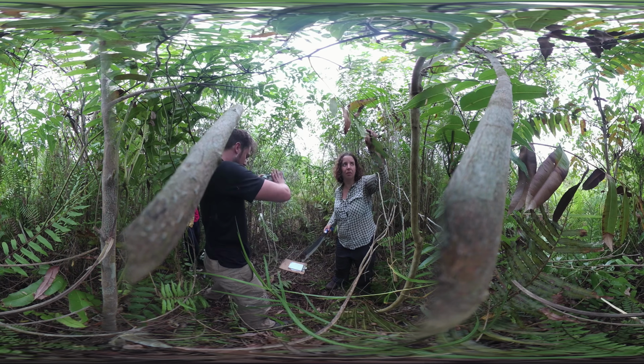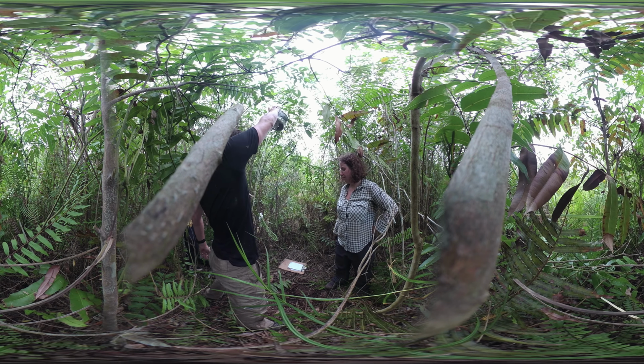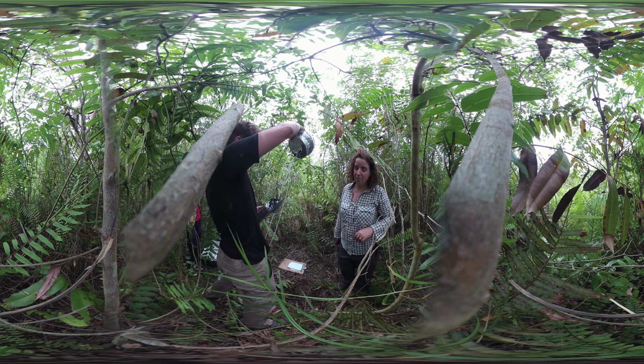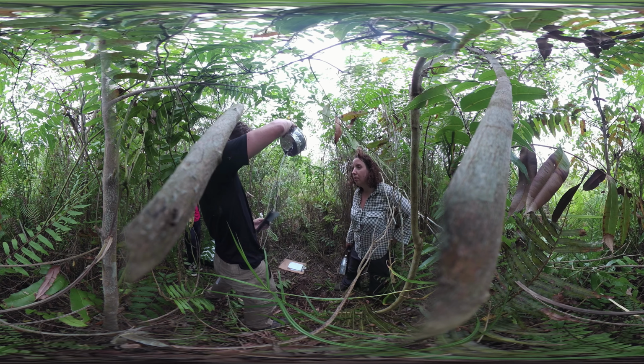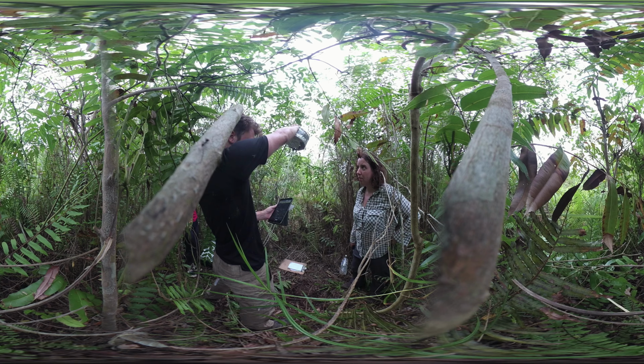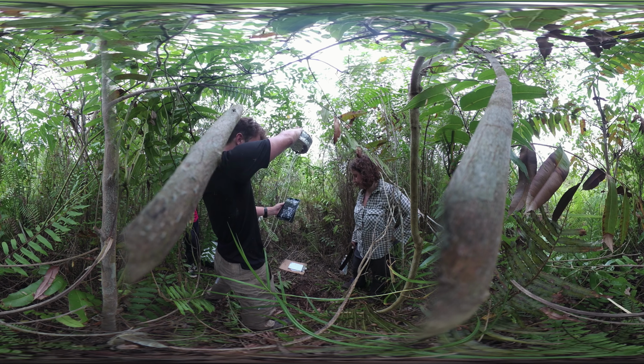Okay, let's make some greenhouse gas measurements now. Just need to make sure we're getting some nice ambient air. To do that, I've got a little iPad connected to the gas analyzer. You can see the CO2 concentrations and the methane concentrations on here.